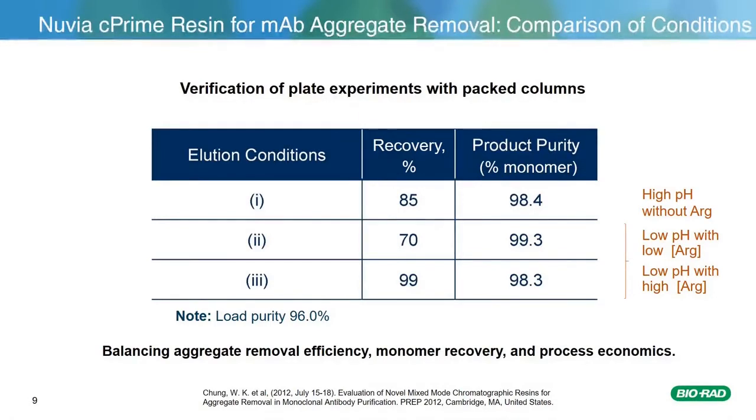Based on these results, the scientists selected an elution condition that balances the need of aggregate removal, monomer recovery, and process economics.